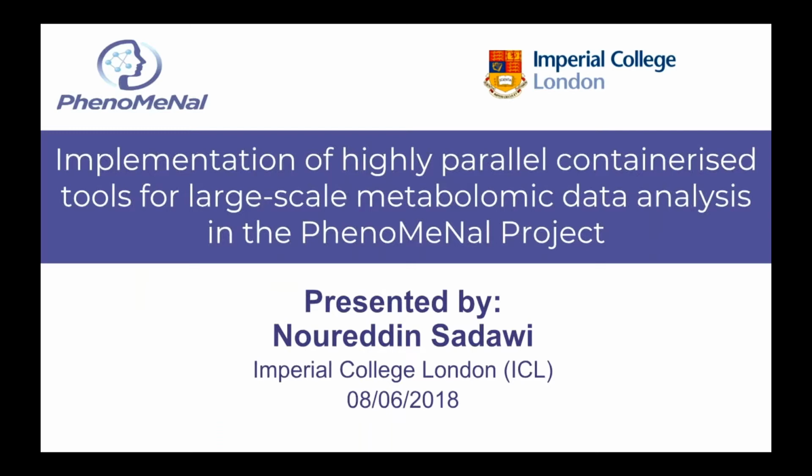I'm from Imperial College London, and what I'd like to do today is show you another aspect or another edge of Phenomenal. So what we're going to do today together is show how to implement highly parallel containerized tools for large-scale data analysis in the Phenomenal project.